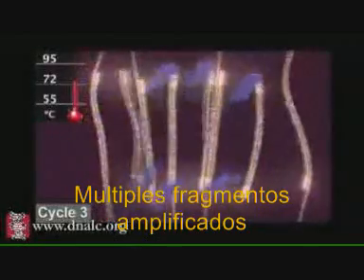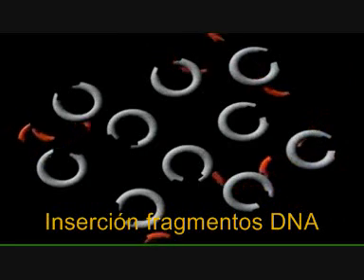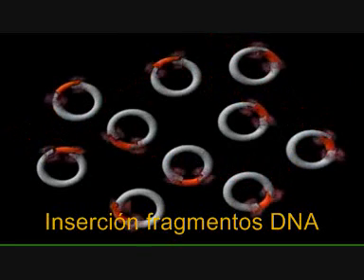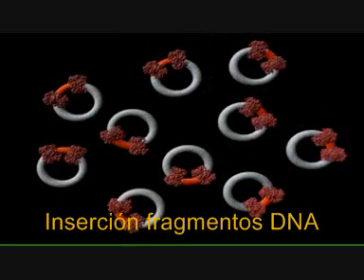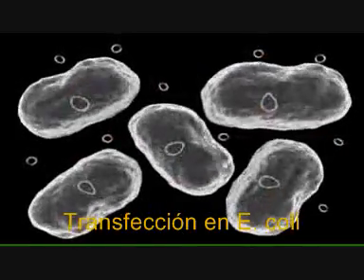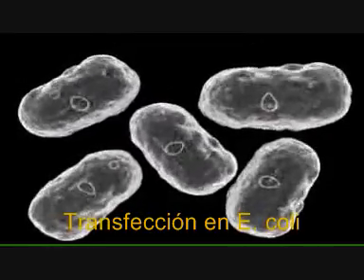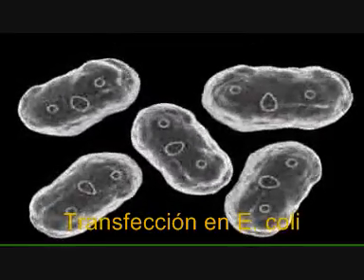After 3 cycles, the target sequence defined by The engineers then place the gene segment they wish to insert into the solution with the plasmids, and then add repair enzymes that join the pieces of DNA together at their sticky ends. These new plasmids, with their newly inserted genes, are then placed with bacteria into a different solution that enables the plasmids to readily penetrate through the cell wall and membrane of bacteria.